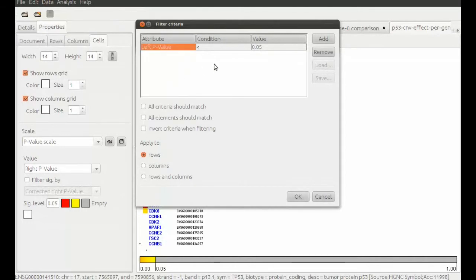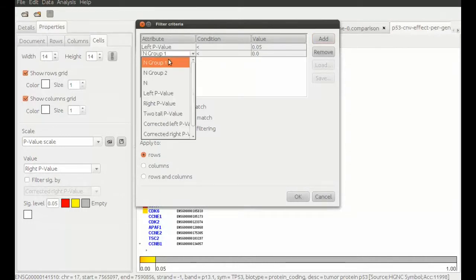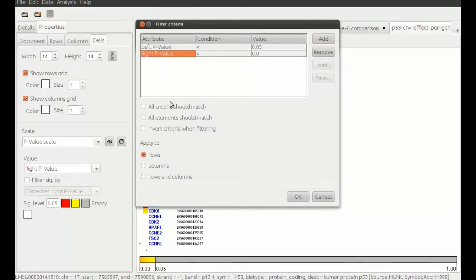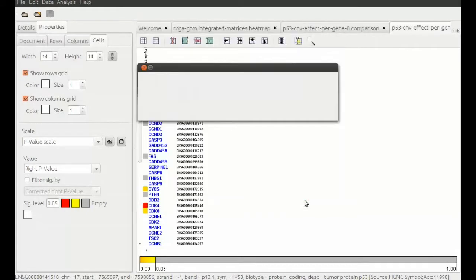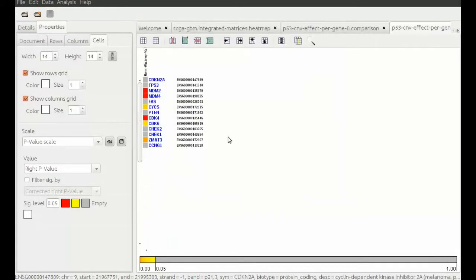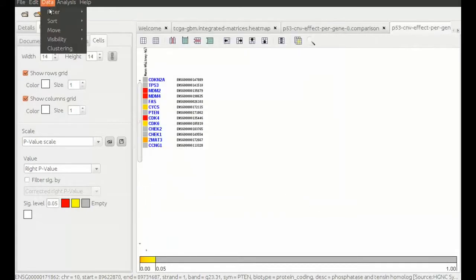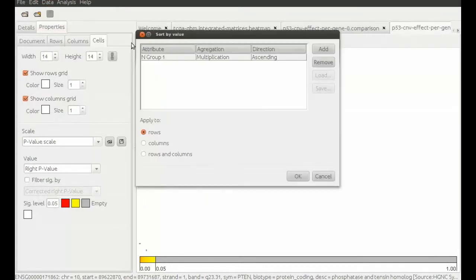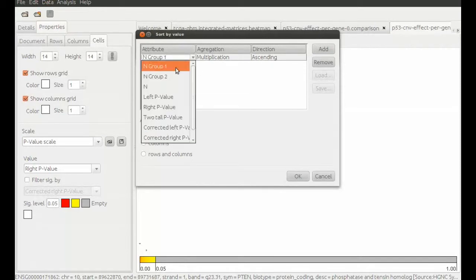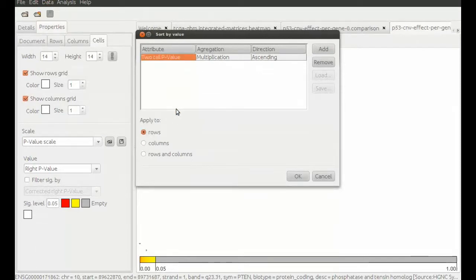We filter for the significant genes both left and right tail. Significance in the left tail means that the gene is less expressed within the altered due to loss. Significance in the right tail means that the gene is more expressed within the altered due to gain. We also sort by significance and can see that our upstream genes are all amongst the top significant.